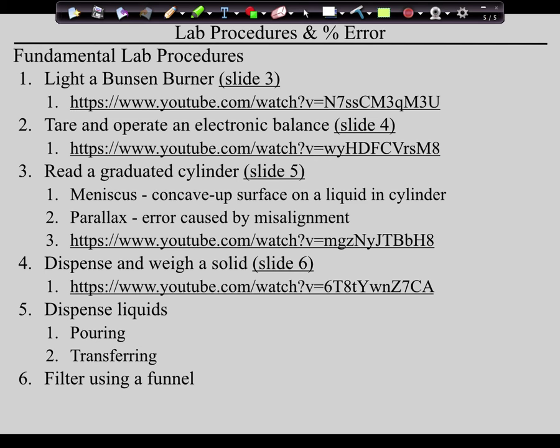Is that okay, or are we contaminating? It's okay, because the dropper will only be used in this bottle. You'll see they'll actually be attached together. The dropper will only be used in this bottle. If it wasn't okay, we shouldn't have stuffed it in there in the first place. So what you do then is drip this down until the meniscus is sitting right on the top of that 1 milliliter line. Once it's there, let go. And what it has done is it has drawn that 1 milliliter of solution up into the bulb. Then you can take this wherever you want it, and you can dispense that 1 milliliter of solution.